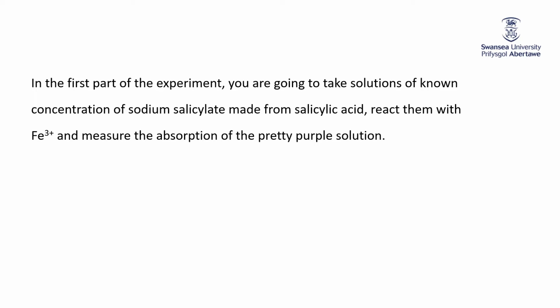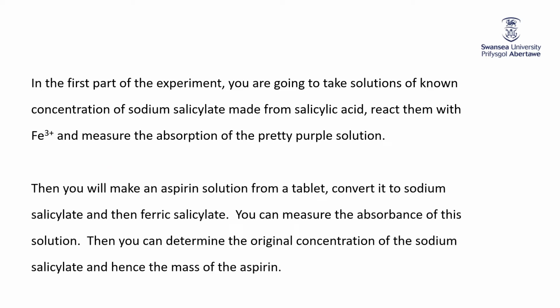So, first part, I'm going to take known concentrations of sodium salicylate made from salicylic acid, reacting with Fe3+. Then we're going to make the aspirin solution from a tablet, measure its absorbance, get the concentration of the sodium salicylate, and hence the mass of the aspirin.